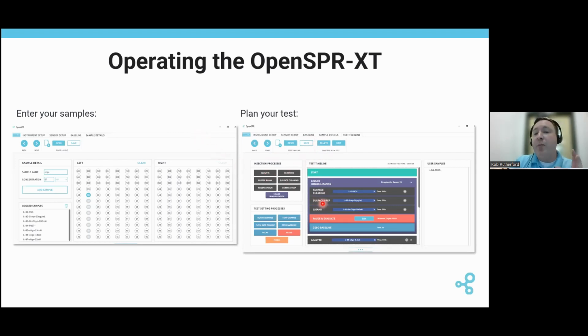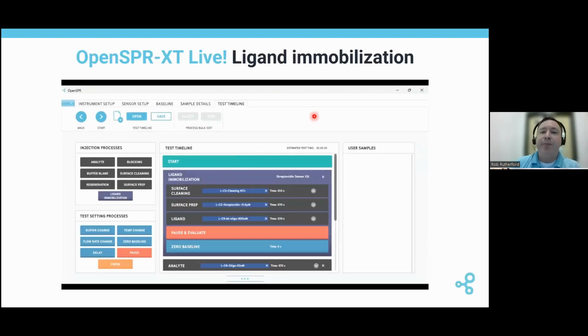So once you've either built your test timeline with your XT, or you've started the test with your manual instrument, there we go, you're going to see your baseline, your live report of your baseline. So what we have here, I have just taken a video for, let's see, just have to drag that up.